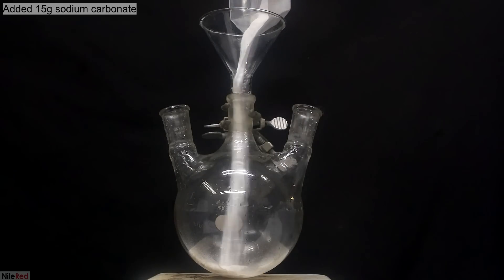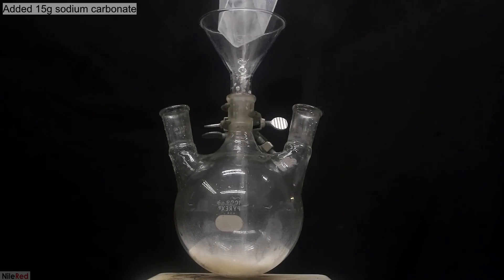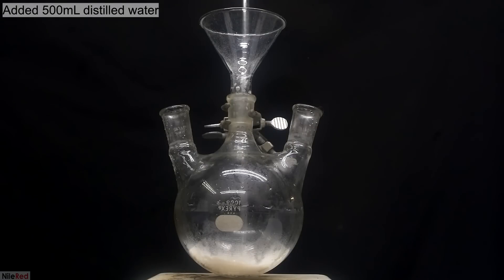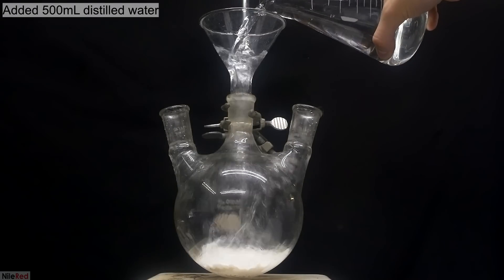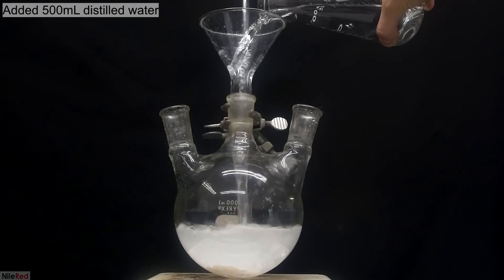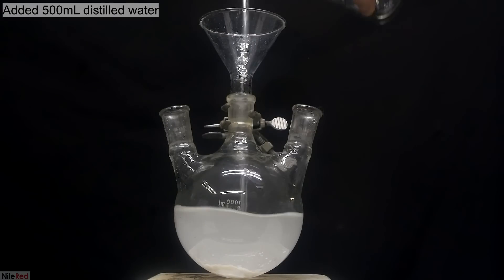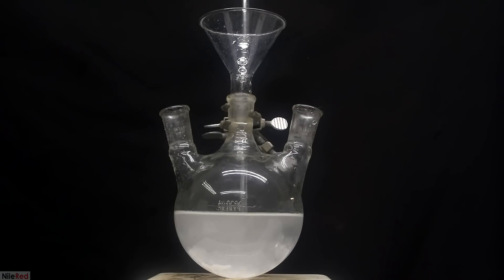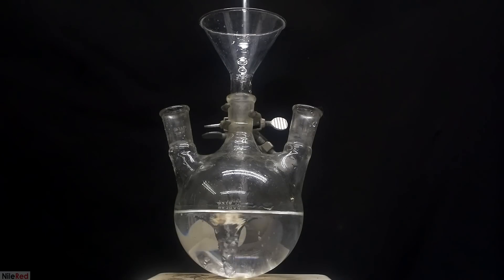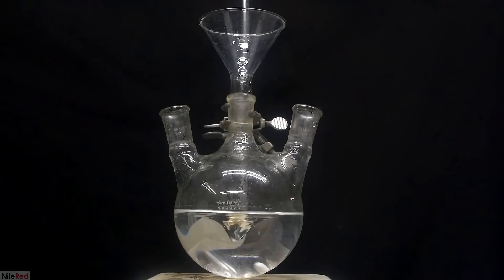I start things off by adding about 15 grams of sodium carbonate. On top of the sodium carbonate, I added in about 500 milliliters of distilled water. I turned on the stirring and I mixed things until everything had dissolved. Just after a few minutes of stirring, everything seemed to have dissolved and we're left with roughly a 3% solution of sodium carbonate.